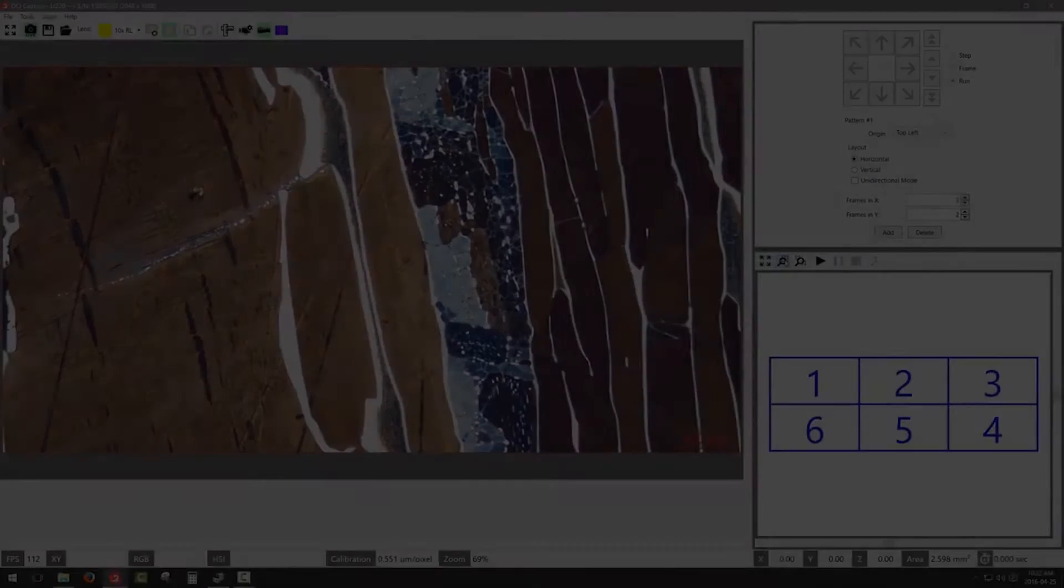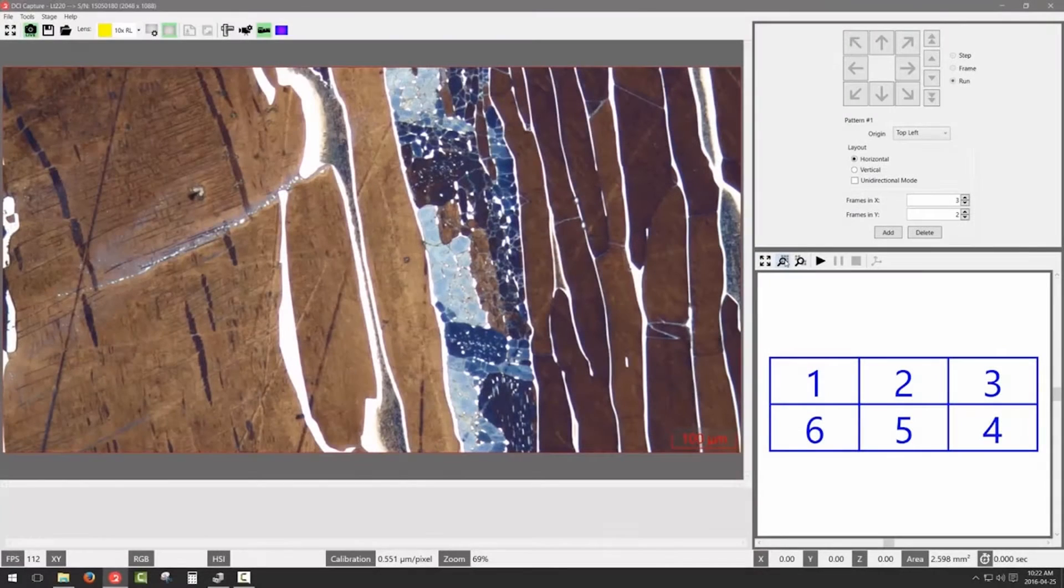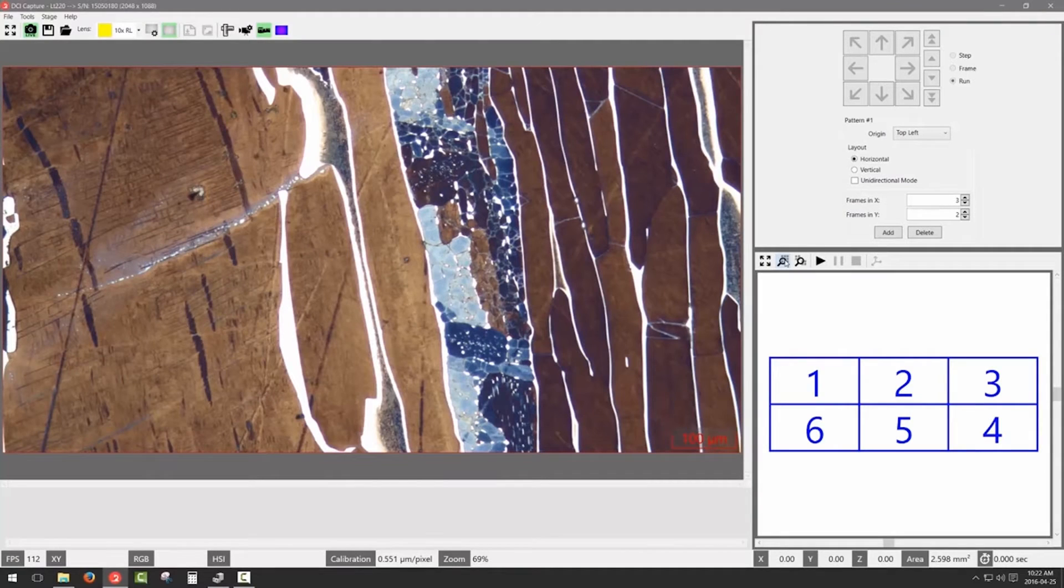To create a mosaic of images with DCI Capture, start by defining a pattern.